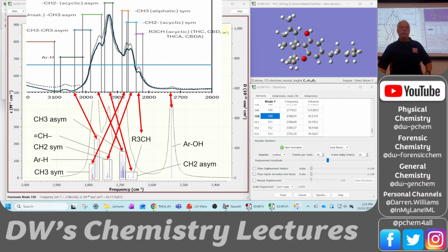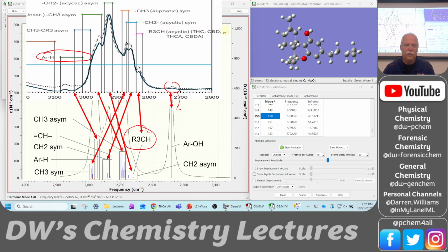But it is nice that from our characteristic group frequencies, these peaks right here are probably the aromatic hydrogens. And the Gaussian helped us assign this one, and this one too. So these are some very good assignments: the aromatic oxygen hydrogen stretch and the R3CH stretch.